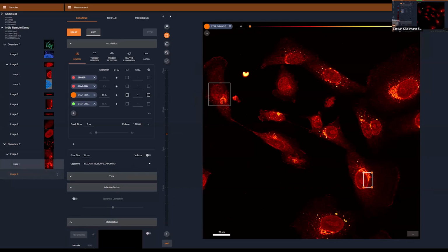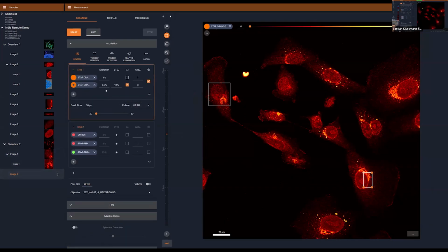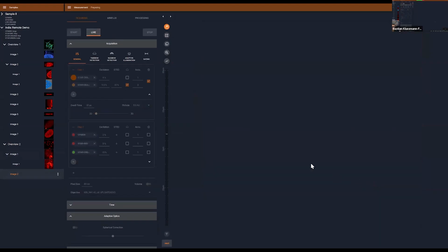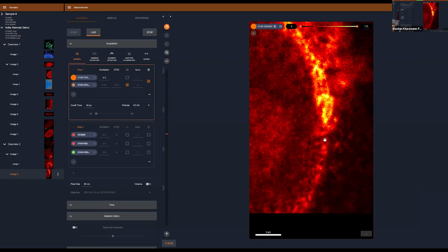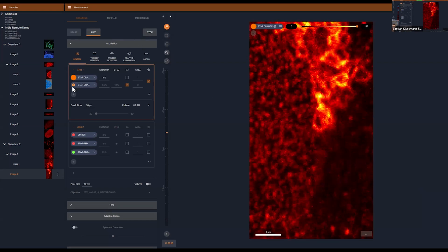So I can again now copy my settings over here, activate the matrix, it jumps in another frame step again. We can increase the excitation a little bit, because the matrix also has a better time resolution and a longer linear response range. Give it a second for the matrix detector to align itself. I can now focus a little bit, something like this. Now I can activate my matrix again.